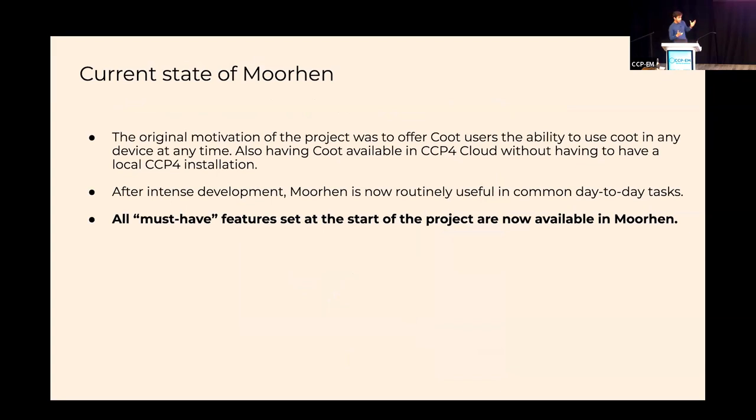After intense development, I'm happy to say that Moorhen is in a state where it is routinely useful in the most common day-to-day tasks. In fact, Paul Emsley wrote a list of all the must-have features that would have to be in Moorhen before the release, and all of those features are now available in Moorhen.